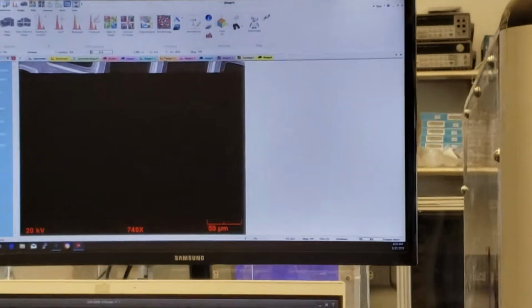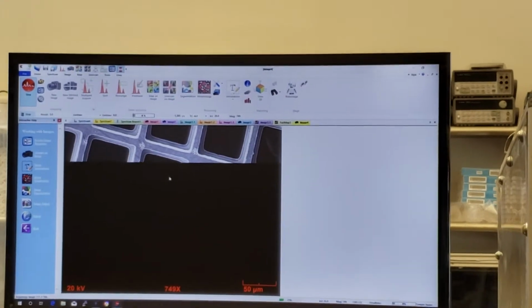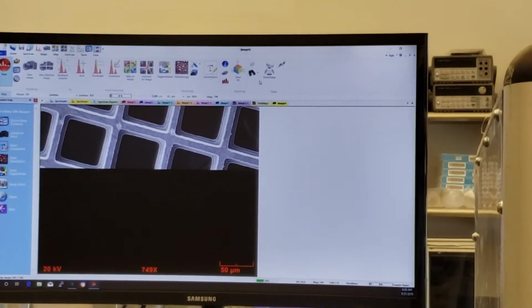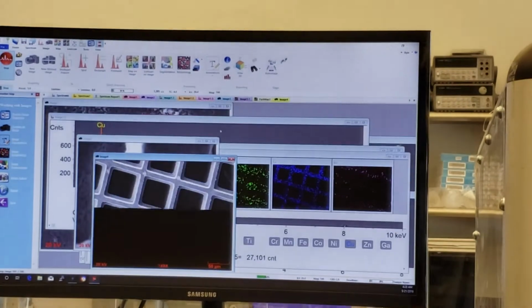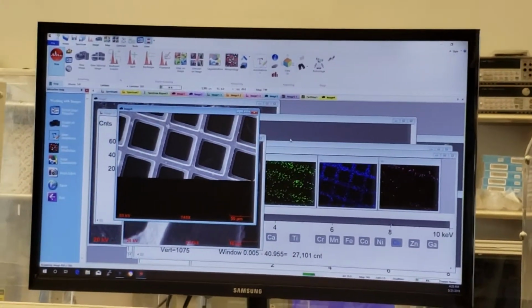And literally, you can have all these images open. Like we have an image open, we can acquire spectra on it, and then you can just save this whole job as one data set. So let me kind of show you that right now, because if we look at all these little windows, we have a ton of job here. It's a lot of work, right?